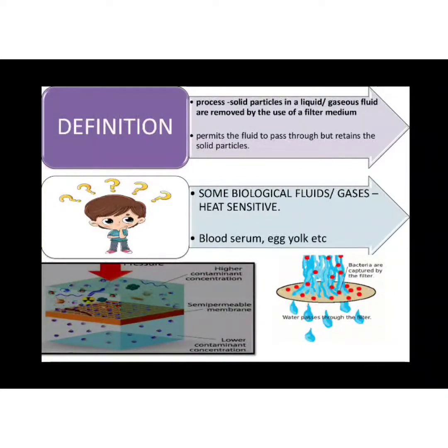Now why do I need to follow this filtration process for sterilization? Is it required? Yes. Generally heat is applied for sterilization to get rid of the microorganisms. But there could be certain media or media components which could be sensitive to heat. In such cases, if the media or component is sensitive to heat, I need to go for alternative methods. Then I use filtration as one of the methods.